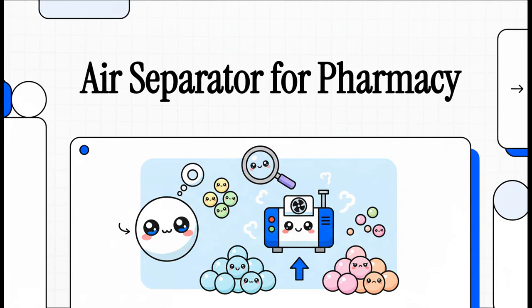Hey everyone, and welcome. If you're in pharmacy, you know that when it comes to powdered drugs, size is everything. Getting it just right is absolutely critical. So today, we're going to dive into a really key piece of equipment that makes all that precision possible, the air separator. Let's get right into it.